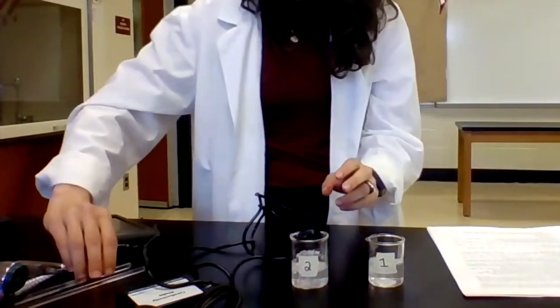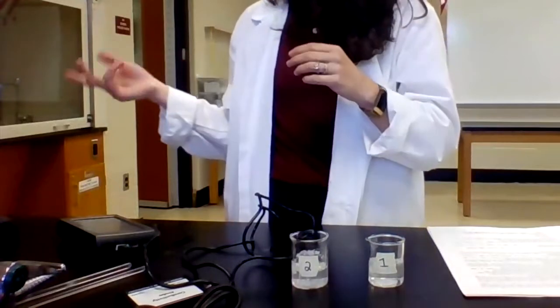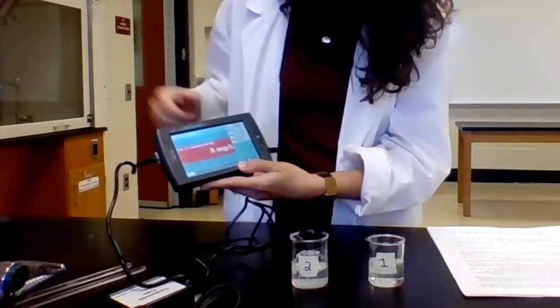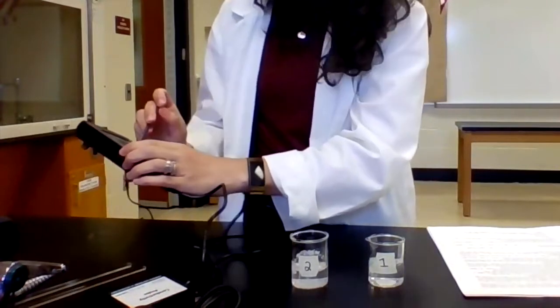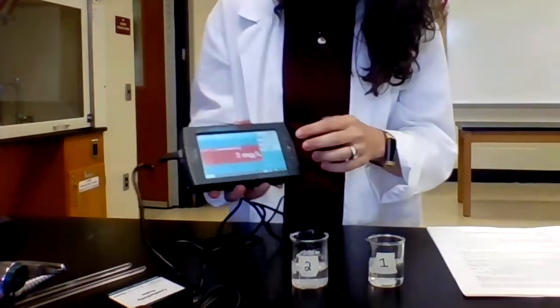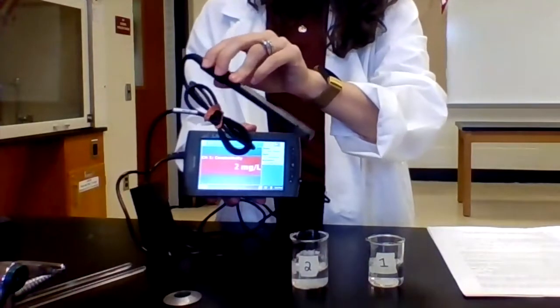So what I have here is a different way of testing conductivity than using the probes that we were using earlier. So we're using the LabQuest here. I'm going to zero out, just like using a balance. So I'll go to sensor, zero, kind of zero out the conductivity. The units here are milligrams per liter. And then here I have my probe.